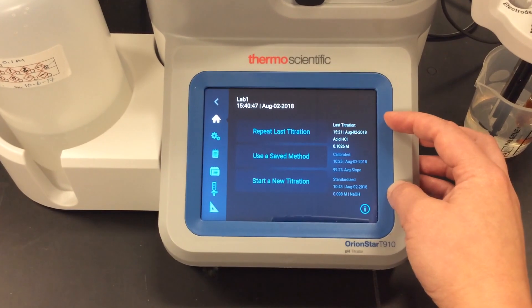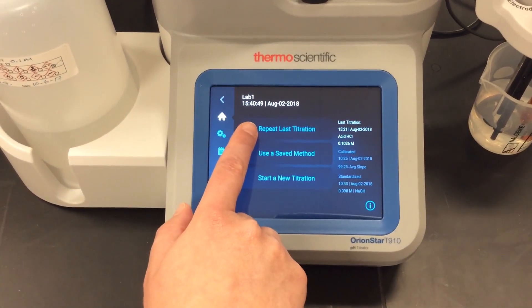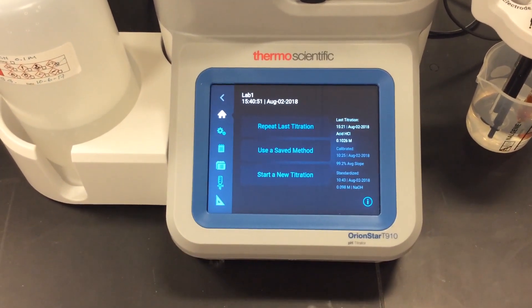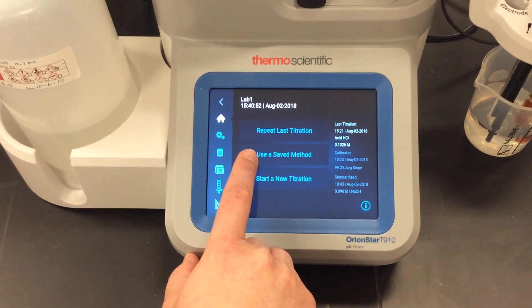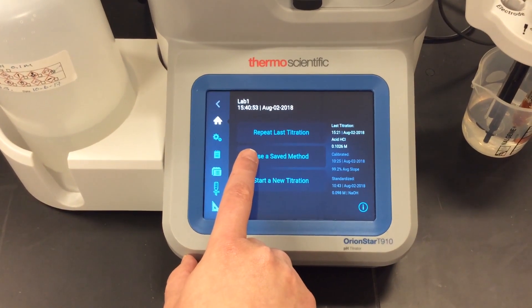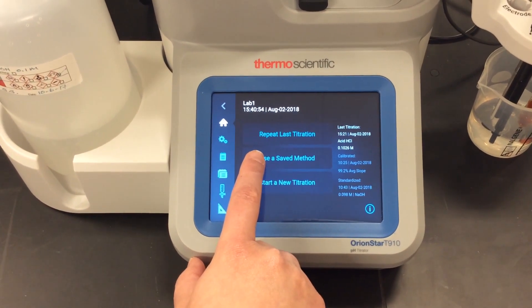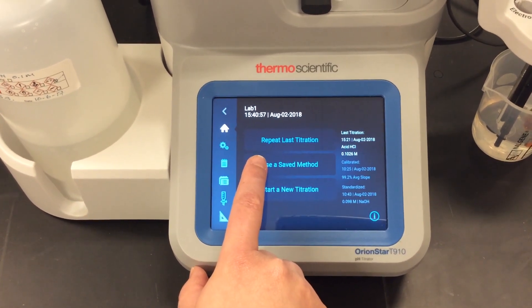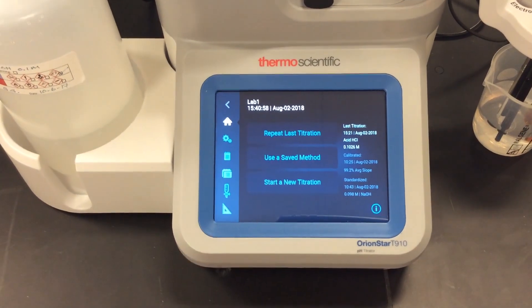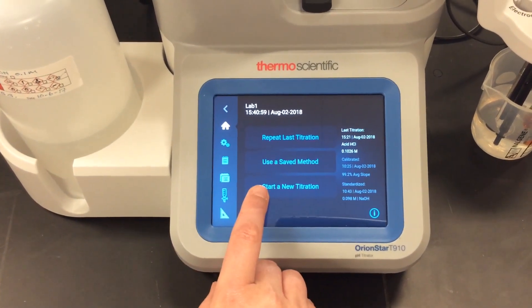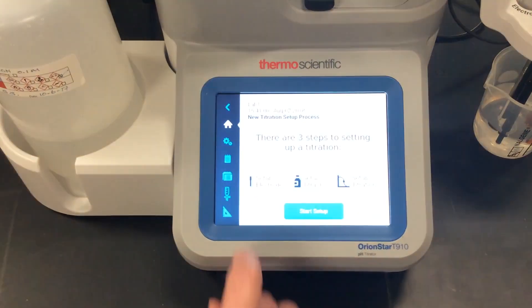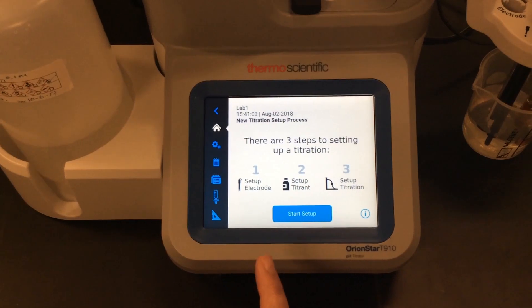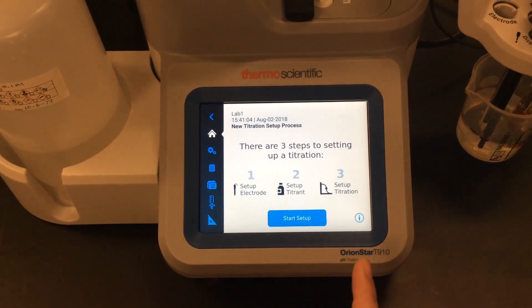I know that all of this information is what will be used if I press the repeat titration button. I can also go to use a saved method to access a different method in case I want to measure a similar but different sample.